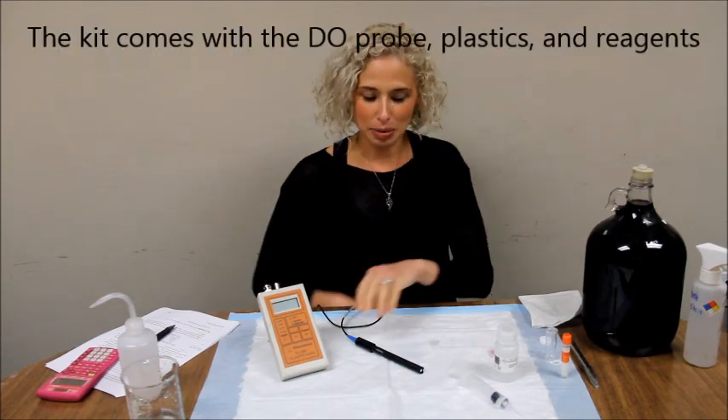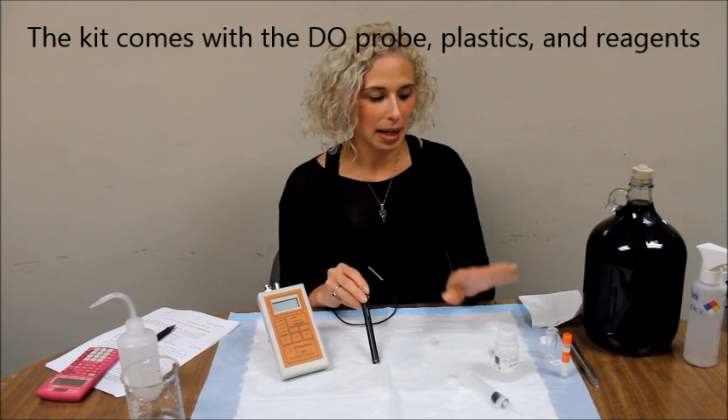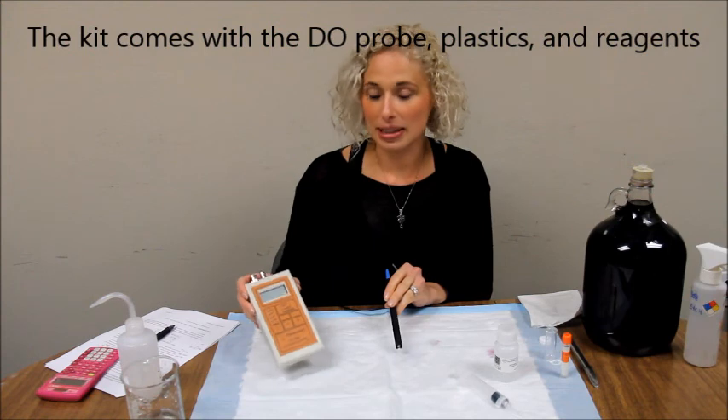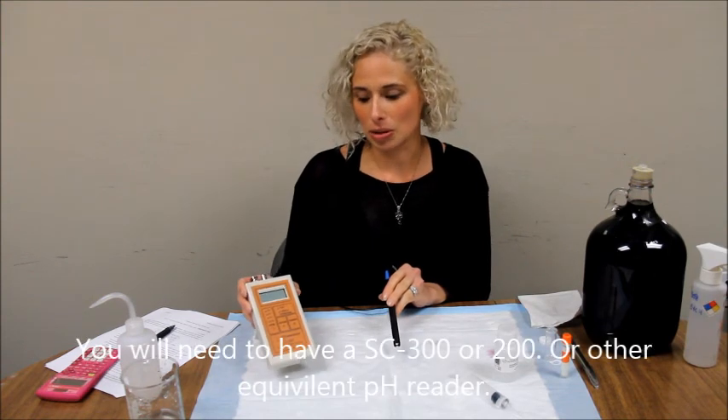Hi, I'm Rachel from Vimetrica and I'm going to show you how to use the Vimetrica dissolved oxygen system. The kit provides you with the DO probe, plastics, and reagents for the assay. You will also need the SC300 or SC200.